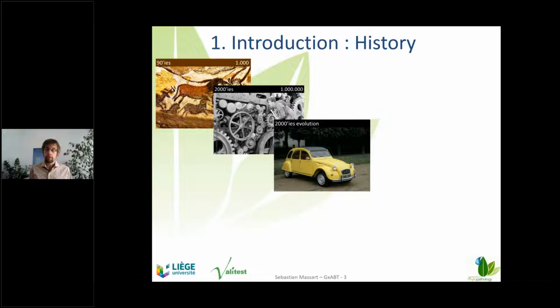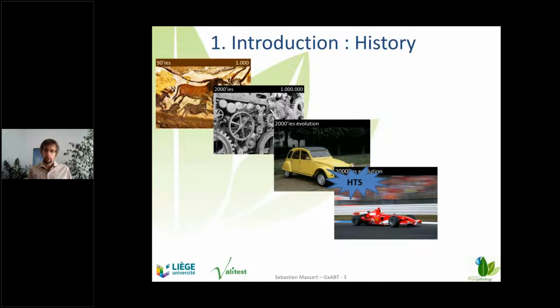You know, for computers, every 18 months, for the same price, you get double the capacity, and that's been true since the 1960s. Sequencing was following this trend in terms of throughput and price dropping. The big evolution came in the middle of the year 2000 with the advent of high throughput sequencing, which was first used mainly for humans and even human pathogens, but progressively, a bit more than a decade ago, it started to be used for plant pathogens or plant pests.